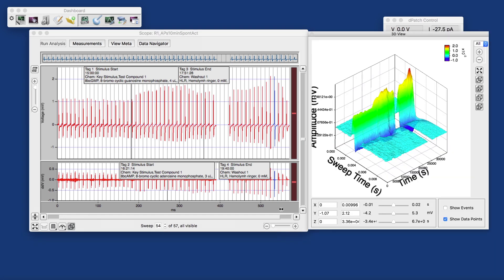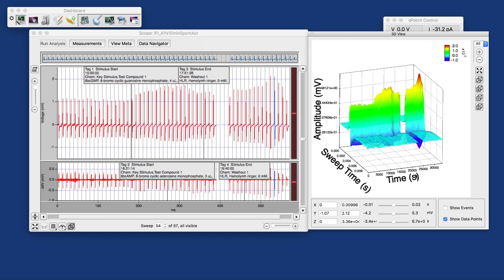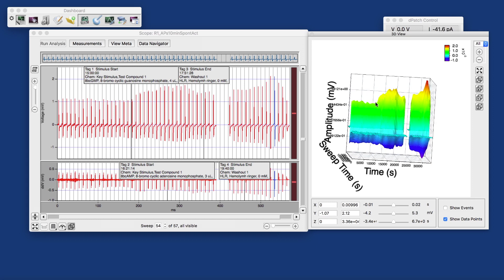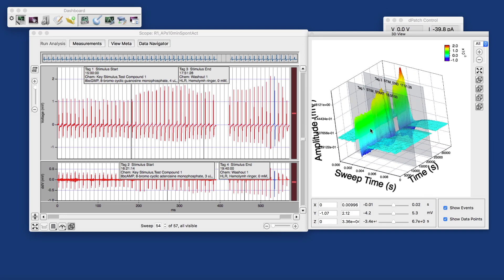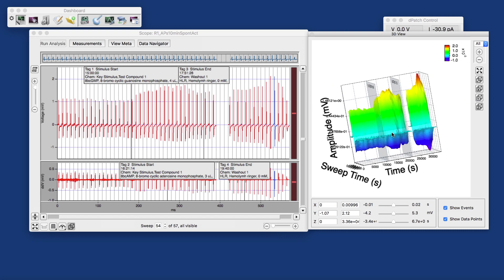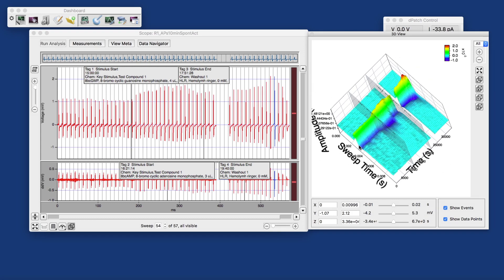One display mode that I'm particularly proud of is the three-dimensional display, where you see the time course of the action potentials over the time of the recording — almost 10 hours. It looks like in the beginning the waveform was pretty stable, until somewhere here something suddenly happens. What happens is we applied a drug here — where it says 'stim start' at the time of that first tag — and that affected the waveform of the action potentials. The peak-to-peak amplitude becomes bigger.